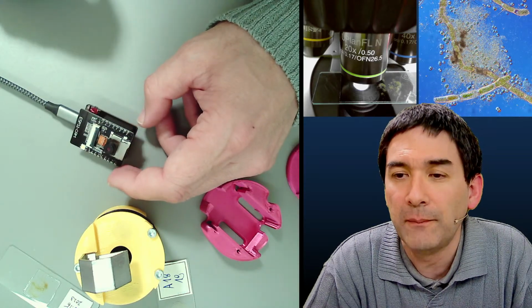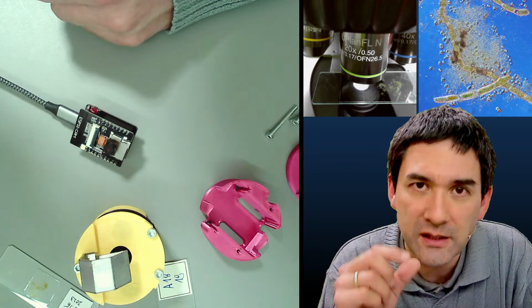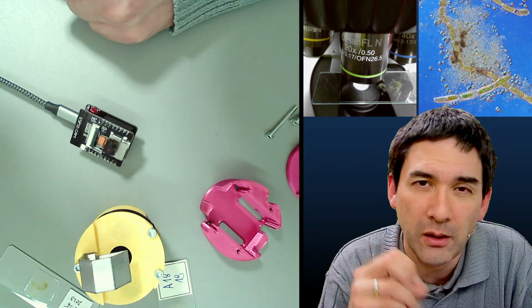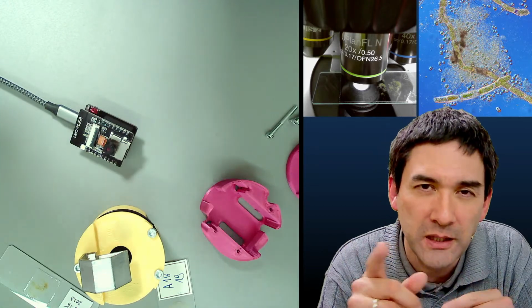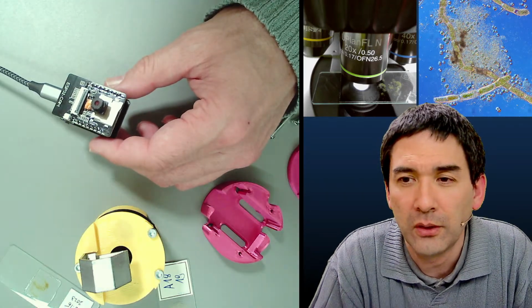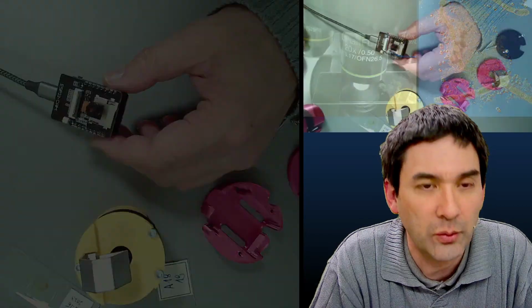The thing is, you have two possibilities. You can either connect a small lens to the mobile phone, or you can also try to somehow connect maybe a microscope objective. But then you have to be careful with the correct distances, and these things are significantly larger as well. So I don't know if this is now going to work.